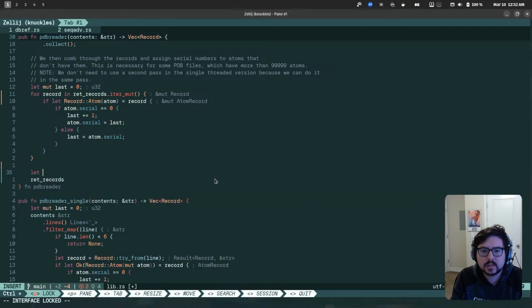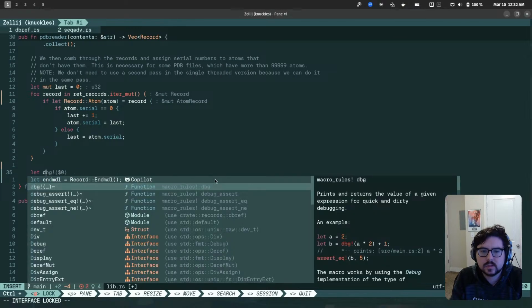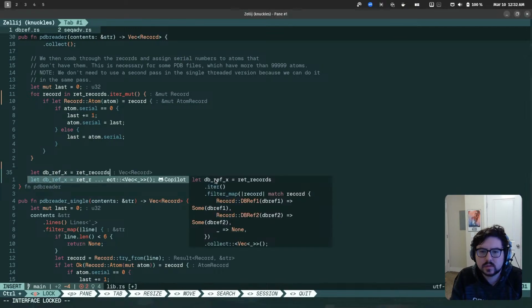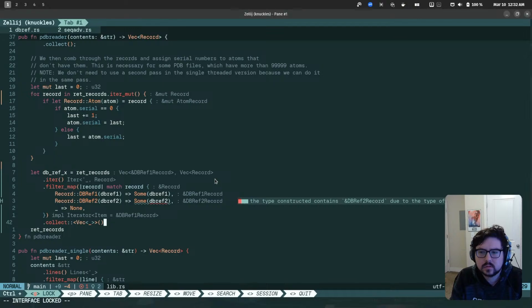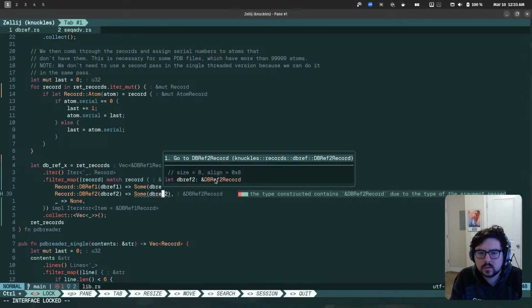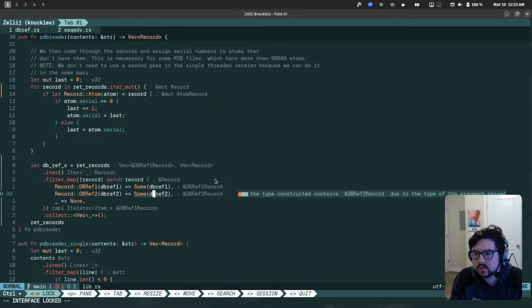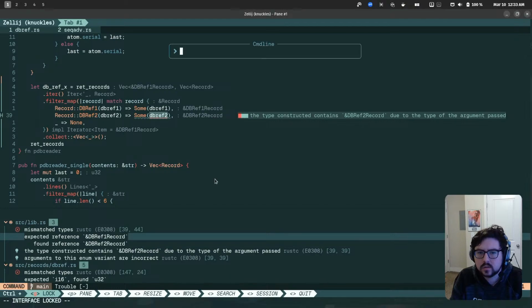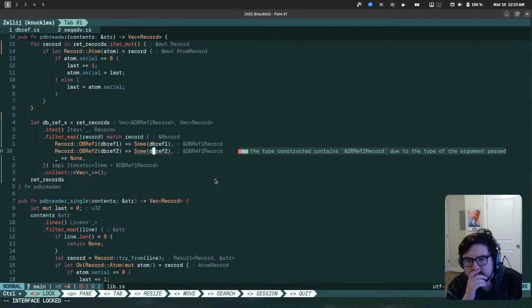Yeah, so we'll say let db ref x equals... hmm.